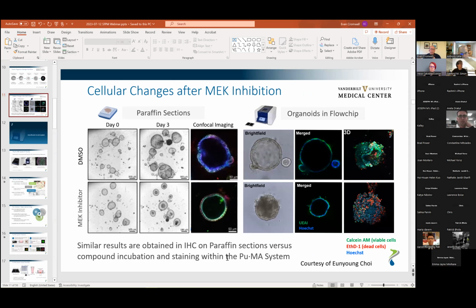What we find is we use a reduced amount of hydrogel, about 25% concentration, which is enough to support the organoids over the course of the 2-3 day assay. And at 25%, hydrogel will also flow through our microfluidic channels. One of the big considerations is that too much viscosity can't flow through the channels.